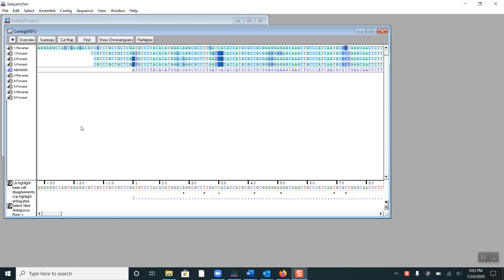At the bottom we have the consensus sequence. A dot below the consensus sequence indicates a base call disagreement, while a plus sign indicates an ambiguity.